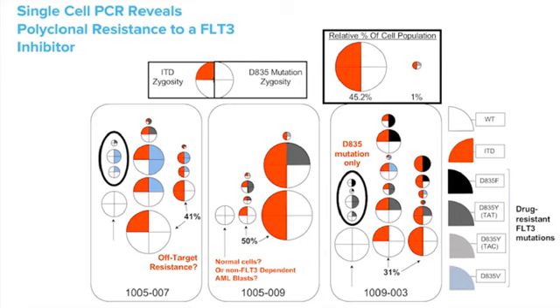What this illustrates, however, is the ability of single-cell sequencing to resolve a tremendous amount of tumor heterogeneity that is present only at 2 genomic loci in a single gene. Imagine the amount of heterogeneity that could be resolved by looking at multiple disease-relevant genes in any given patient.